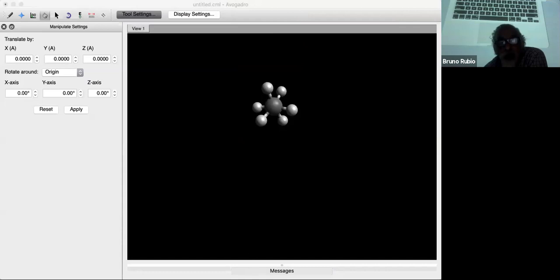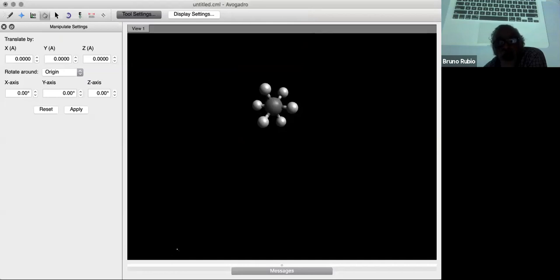So let's click on that, conformer search, and just click OK. All of this is preset. You really can't mess around with that. Just click OK and watch this model, see what it does. See how it changed a little bit.